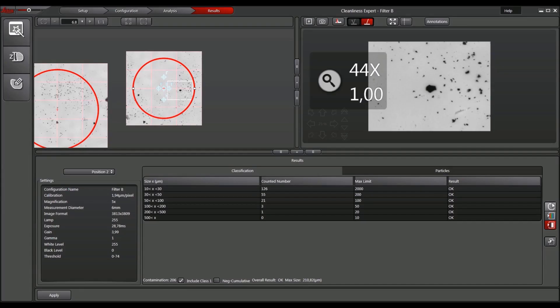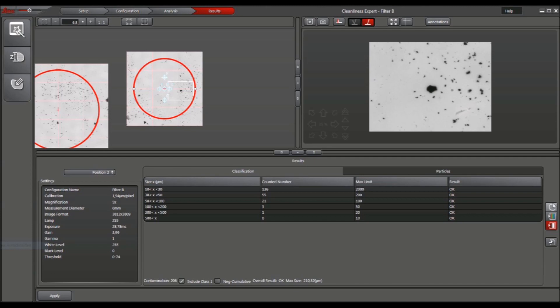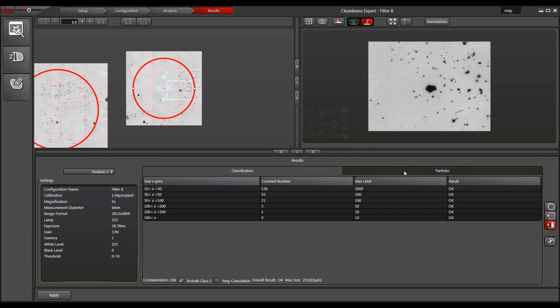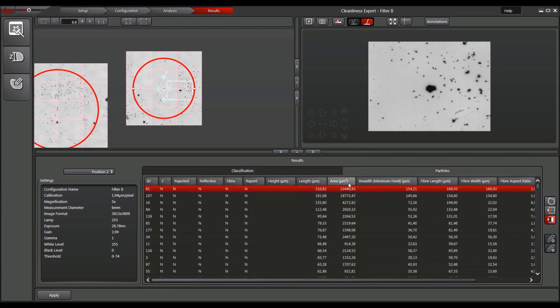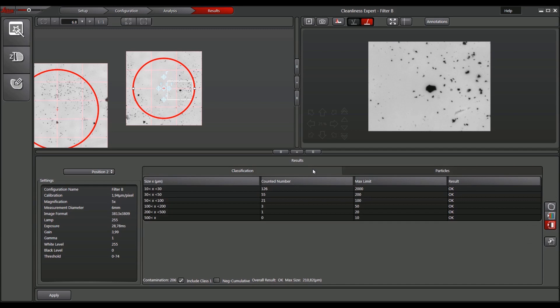The particle with the largest ferret diameter is shown in the live viewer's upper right corner. Its position on the filter sample is indicated in the sample overview on the left side. If required, the user can now review all detected particles to edit or reclassify them.